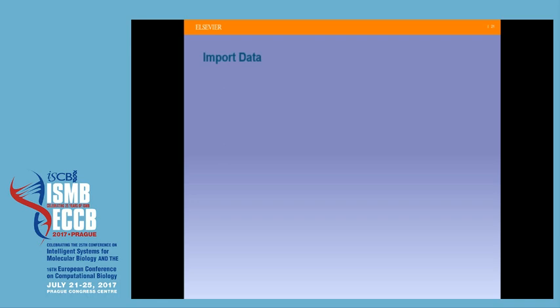So first we import our data. We have a full import data function. What we're going to use is a data set available in GEO. Essentially, what the researchers did is they took neural progenitor stem cells and infected them with the Zika virus, with the idea being, what's happening particularly in neurons that would possibly lead to this particular phenotype? And then they harvested them at 56 hours and compared them to the controls that were not infected.